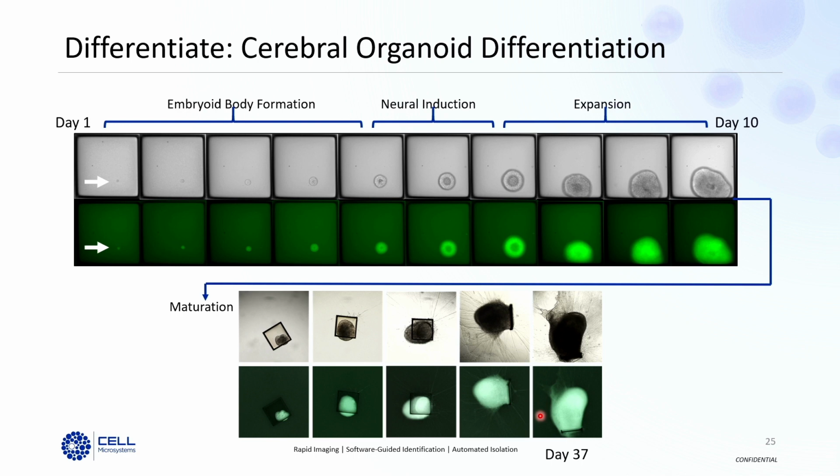Yeah. So currently we're not using any fluidics or any sort of dispensing methodology. The workflow is much simpler than your dome, right? So when you're pipetting a dome, you have to make sure it's right in the center of the well, so you don't have organoids traveling to the edges and things like that.